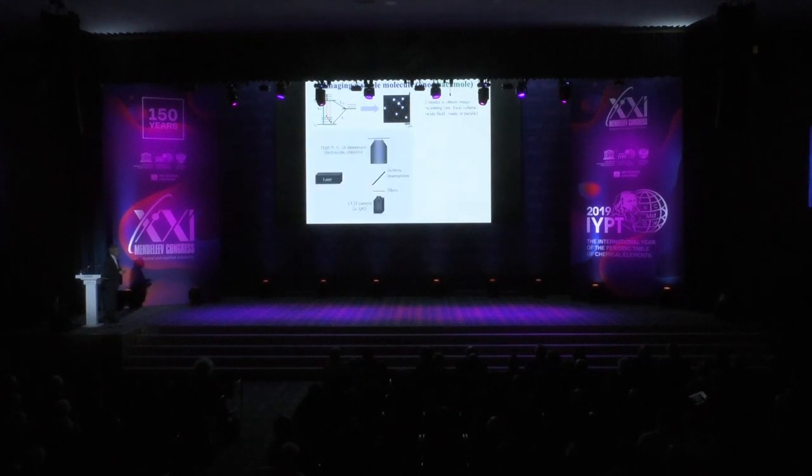And so think of it this way. A laser is sent through a microscope. It's focused with an objective, which I cannot point to. Then the emitted light is shifted to long wavelengths due to the Stokes shift. And so the detection system, which is a camera or so forth, needs filters to block out the pumping laser light in order to detect the light from the molecule.